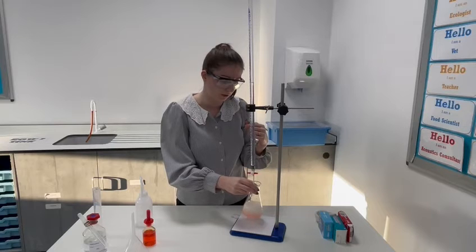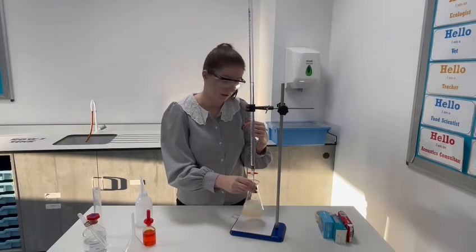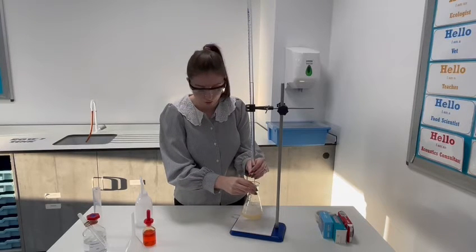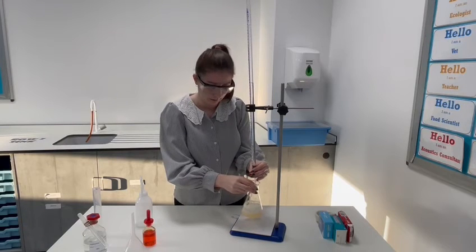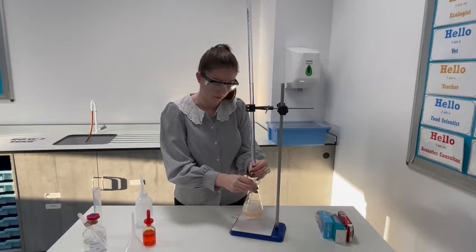Again, we want to keep going until our colour change sticks around for a minute. So I'm very close to the end point now, so I'm going to add just a drop. So adding drop by drop until we see that colour change.